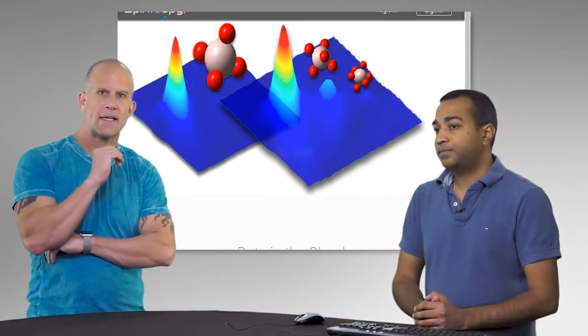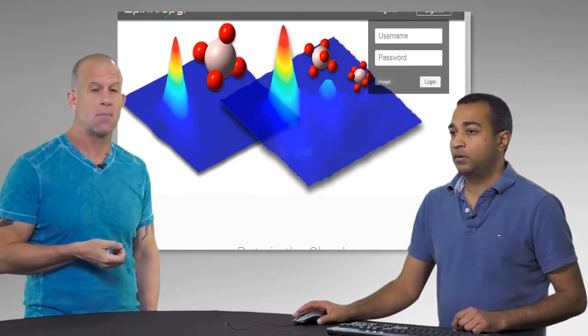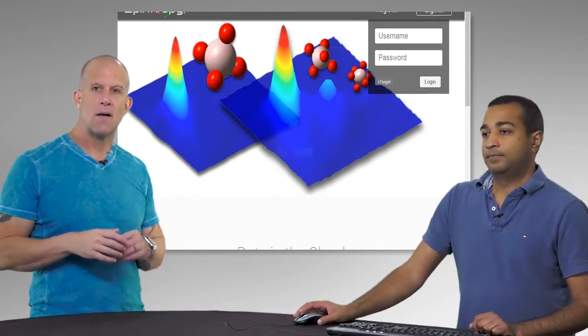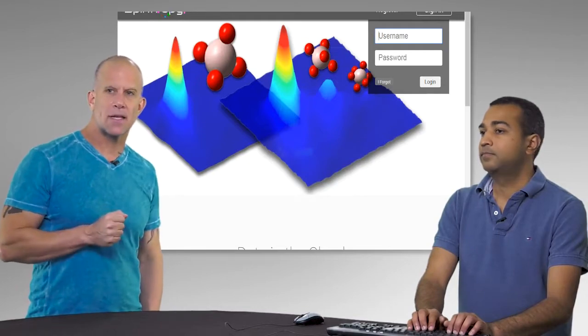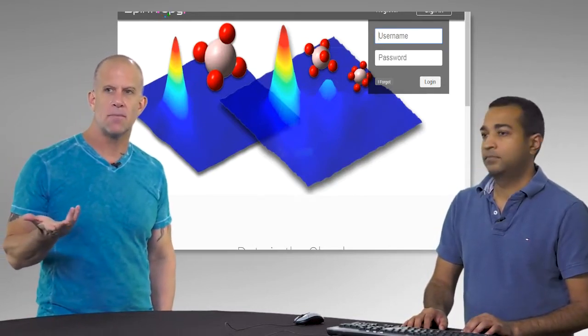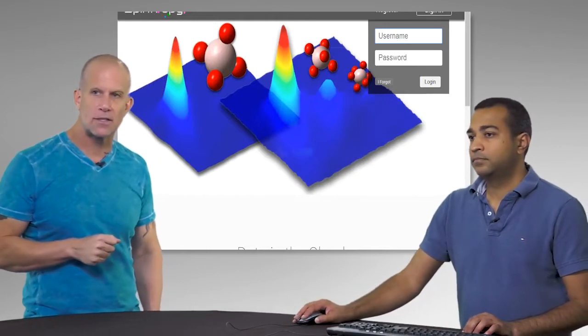So what we're looking at here is the front page for spintropy.com, right? So this is a website where, now what about if they don't have a username and password, or they haven't already, so then they instead click the register button?